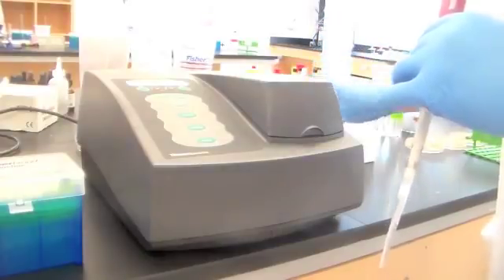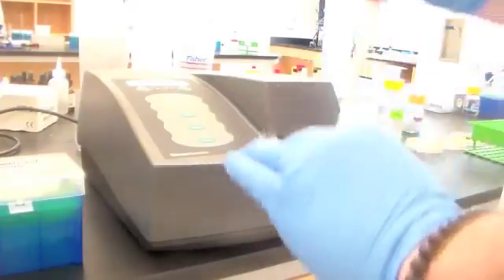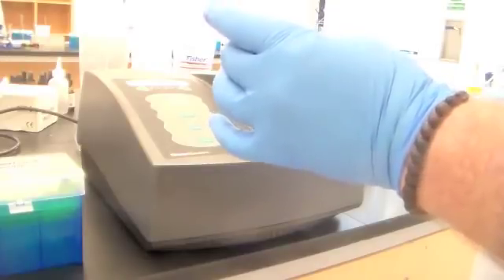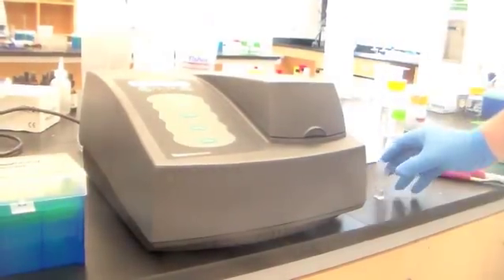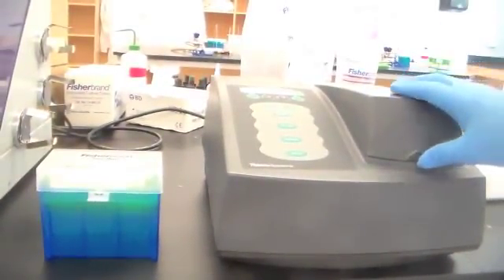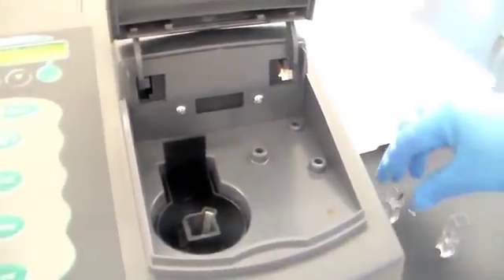Okay, now with that 500 microliters, the first thing that we're going to do is to take an optical density reading. So we're going to use a spectrophotometer to determine how much light is absorbed by this particular culture. There are cuvettes here that you will pipette your 500 microliter sample into. This is my sample. This is the spectrophotometer. It's set to 600 nanometers wavelength, so it's passing a light beam through a chamber at 600 nanometers.